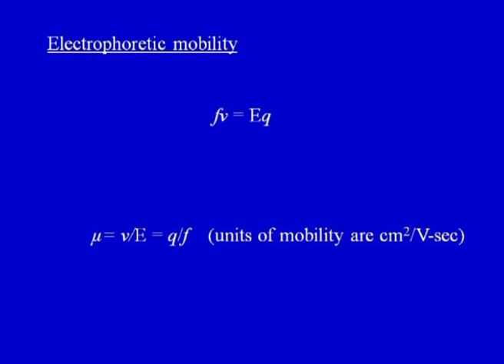This has to be understood: at the beginning, as the field is applied, the charged particle will accelerate through the medium, but soon the frictional force catches up, and that happens very quickly, the two forces become equal, and then the charged species moves with a constant velocity.